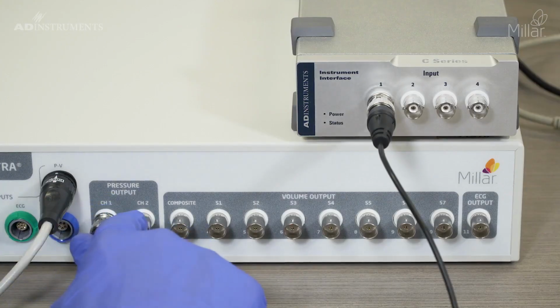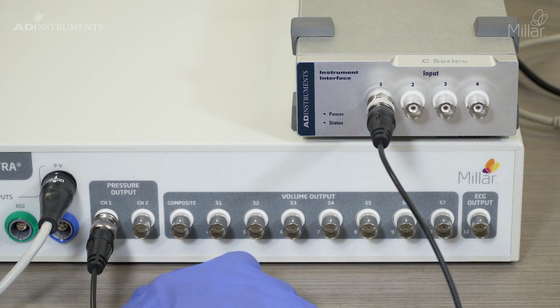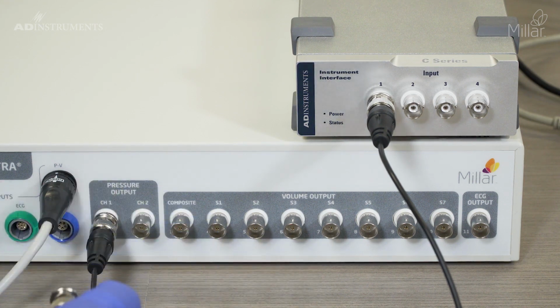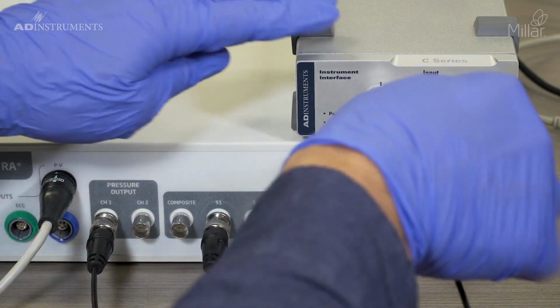Next to the pressure outputs, we have 8 outputs for volume. The first BNC is the composite output signal. This is the summation of 7 segments. The composite connector should only be used when recording from multiple segment catheters. For single segment catheters, we will connect S1 or segment 1 to the second input on the instrument interface.